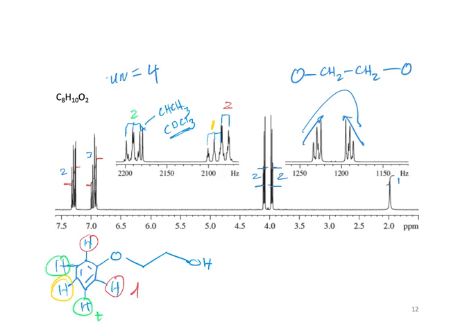The other way we can confirm this is that the protons ortho to the ether are the most upfield. Or notice that the ortho and the para positions are more upfield. So why would that be? Resonance, right? I think we talked about this before.